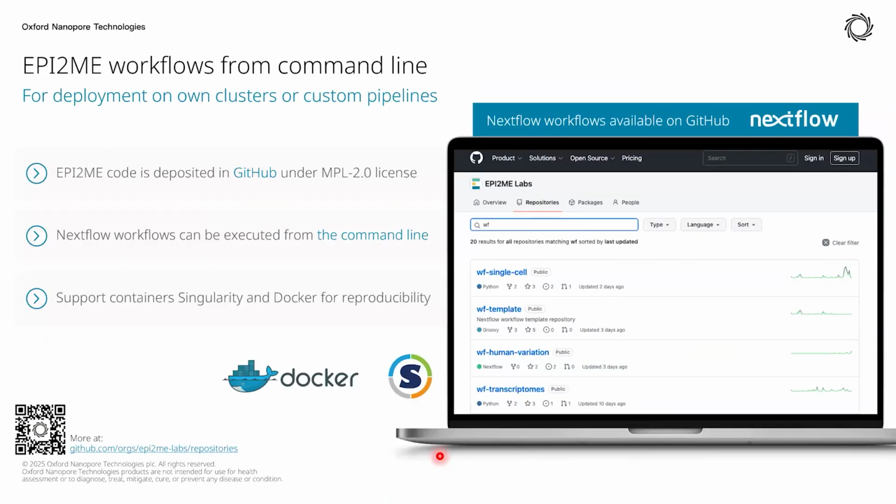Okay. Yeah, so if you're interested, again, all of our code is on GitHub. So these are all open source workflows. You can go into them. You can see the WF template workflow there, which is if you wanted to develop your own EPI2ME focused workflow. These are all Nextflow workflows.